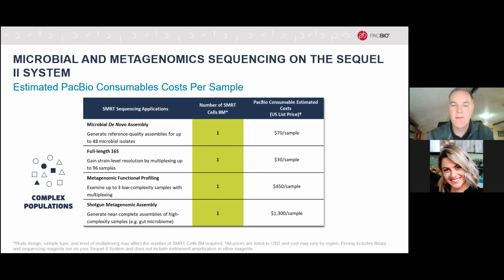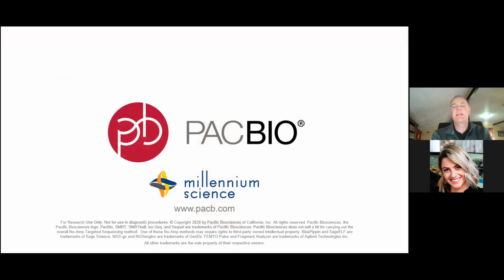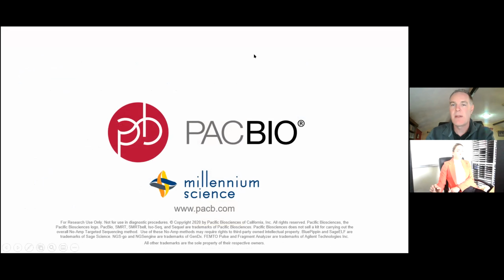And for the full shotgun assemblies, so you're getting full assembly of all your community genomic DNA there, maybe a single sample there at about $1,300 for the sample on a single SMRT Cell. So I think that's probably it for today. It gives you an overview of what you can do with PacBio in terms of microbiome and metagenomics.